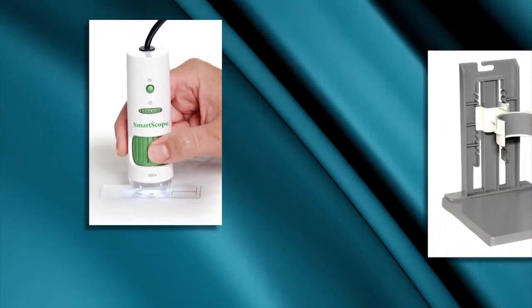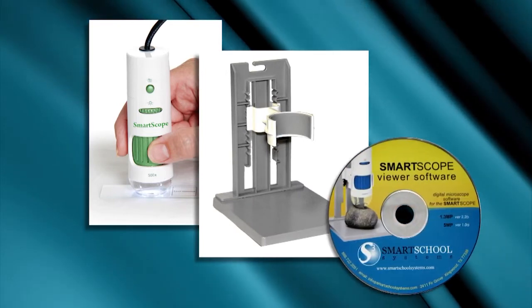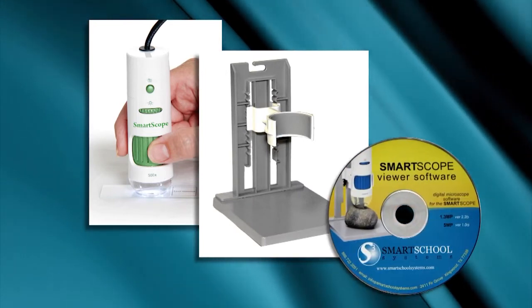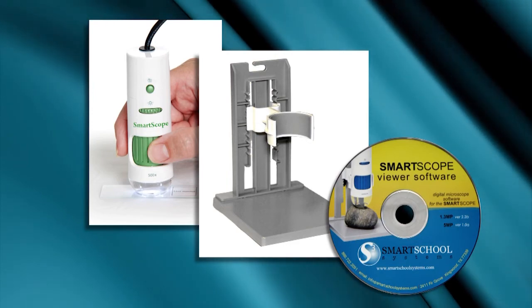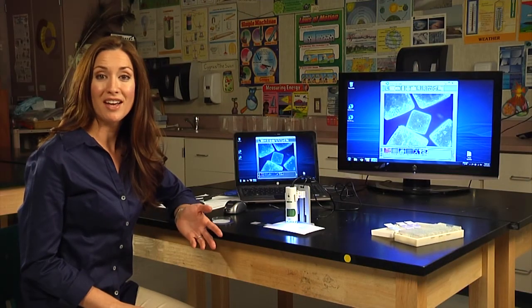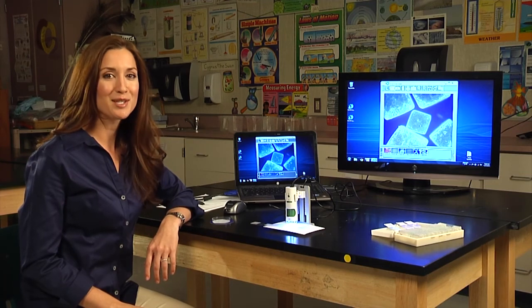Included in the package is the SmartScope 500, the stand, and the software site license, so you can install the software on all of the computers on your campus. The software is compatible with both PCs and Macs, and the SmartScope works great with interactive whiteboards. The SmartScope 500 is fun, it's easy to use, and it's a great way to get your students excited about learning.